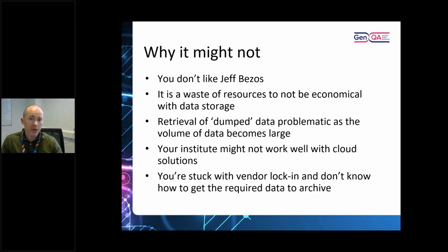And where that becomes difficult is if you have to do retrospective analysis. You've got maybe 1,000 files where you would have previously had 100. It's going to take more than 10 times as long to get those data back. If you want to do some sort of analysis, it can really slow down data retrieval. And if you have 10 times more files and you have to do a retrospective analysis of everything you keep on file, it's going to take 10 times longer.